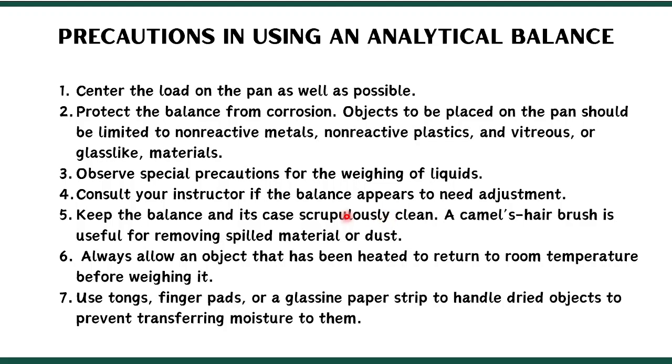And if ever na may mag-spill over na solids or mga chemicals, we can use this camel hairbrush or pwede na po paintbrush para mahinluan ang sulod, no? To remove those spilled material or dust. Sixth, we also need to always allow an object that has been heated to return to room temperature before weighing it. So, dapat pabugnawon sa nato before nato siya timbangon.